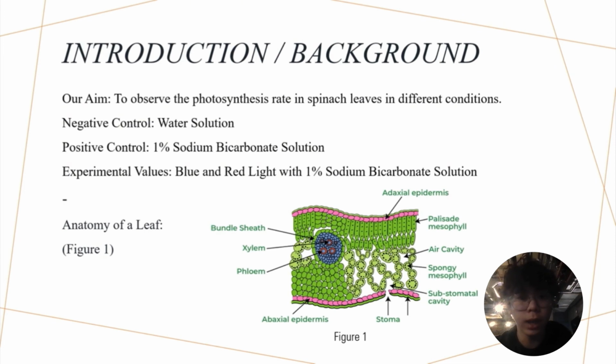By removing the gas and air products from this layer, the spinach leaves become more dense and sink to the bottom of our test liquid. This is achieved by the pressure of the syringe in our procedure.